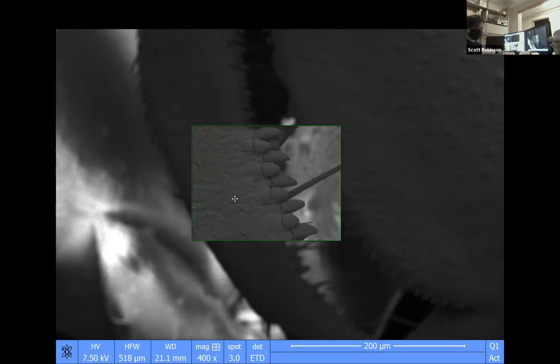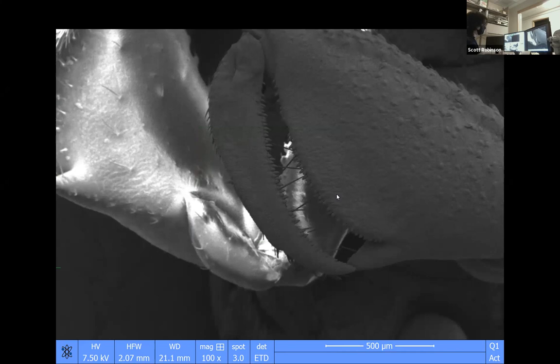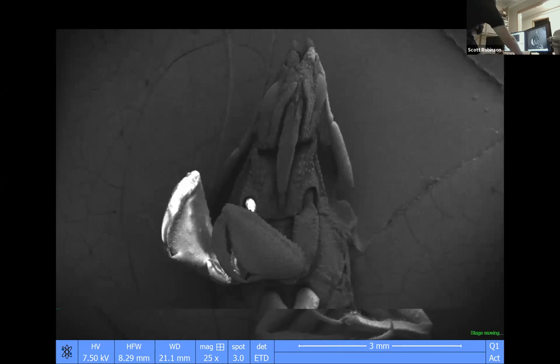Is there a way to zoom back out? Hit minus a few times. Yeah. And then you can also get rid of that small screen by doing that. Okay, so now you can drive around. You can click with the roller ball and drive like this.